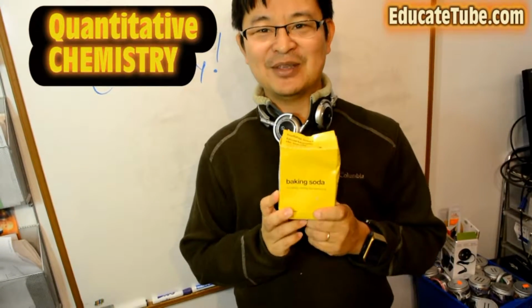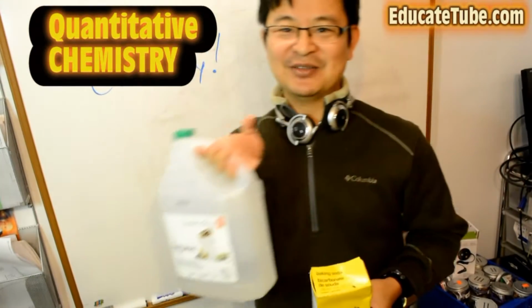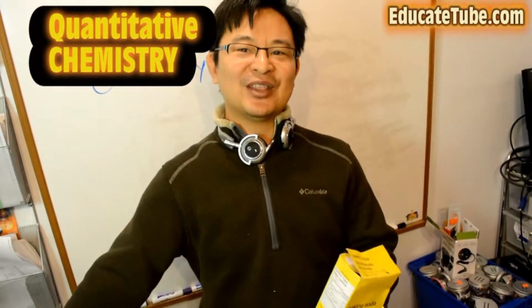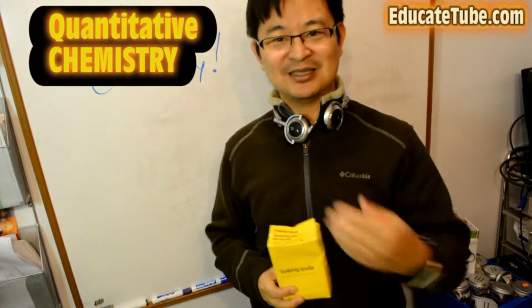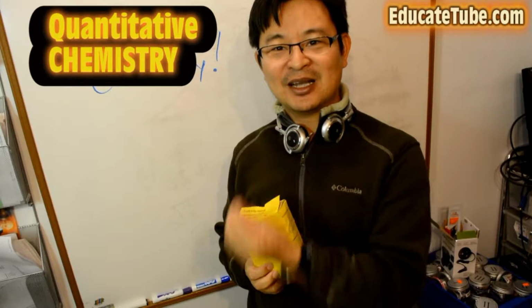I have here baking soda, which is sodium bicarbonate. And I also have here a 5% vinegar, which is acetic acid. So we're going to combine them together, and we're going to predict how much of the byproduct, which is gas, is forming. In this case, we're going to look at carbon dioxide.